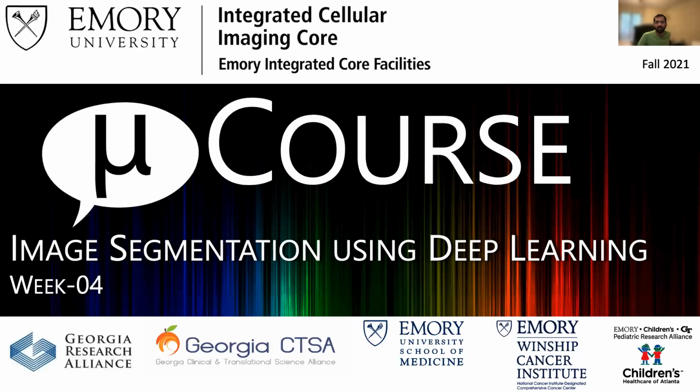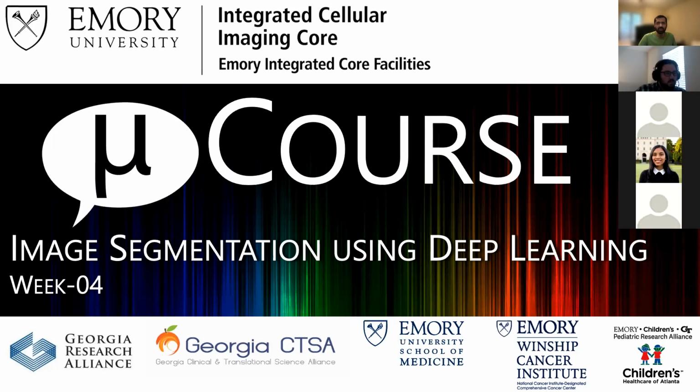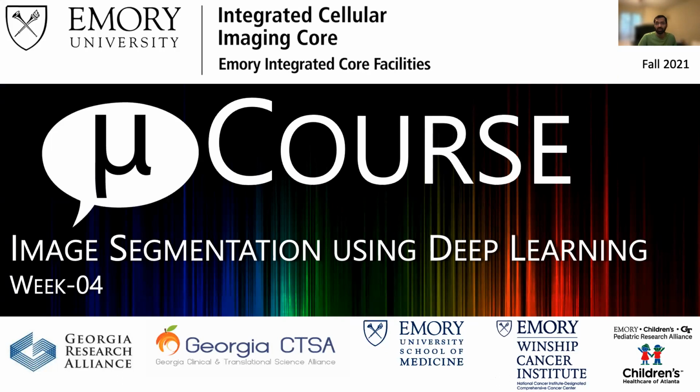All right, welcome everybody to our fourth week of image segmentation of our micro course, where we'll be going through image segmentation using deep learning. This is going to be more fun in a way, although it looks very complex, but frankly, it's just a bunch of clicks and you can go ahead in your life with what you need in terms of your final data set. And some of the images that we will generate today, we will be using next week in CellProfiler, okay?